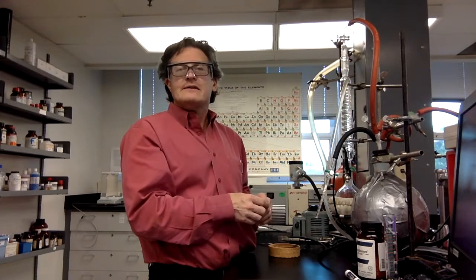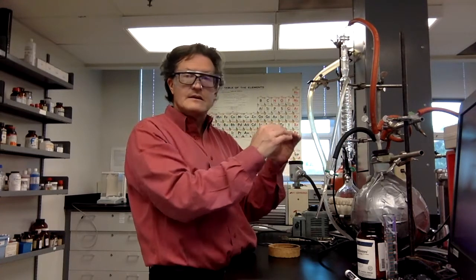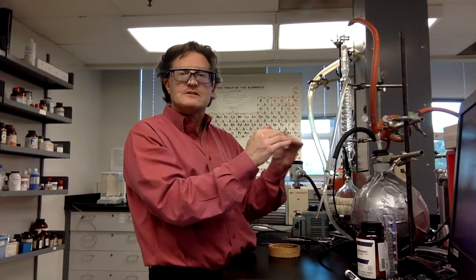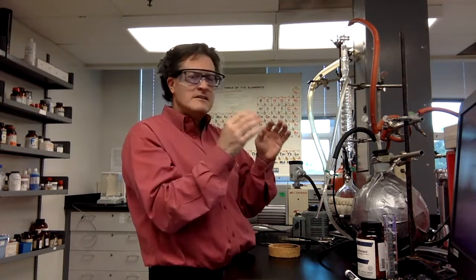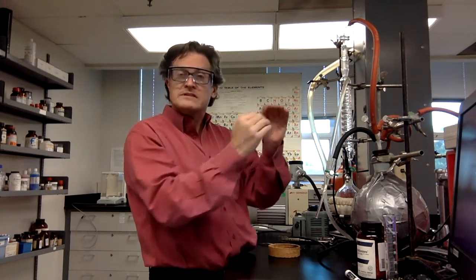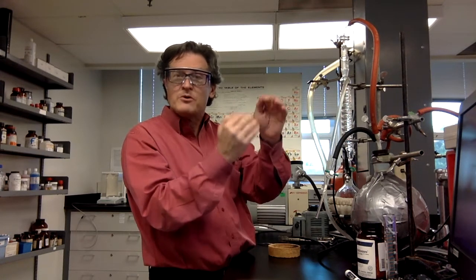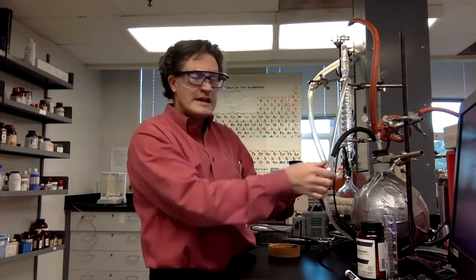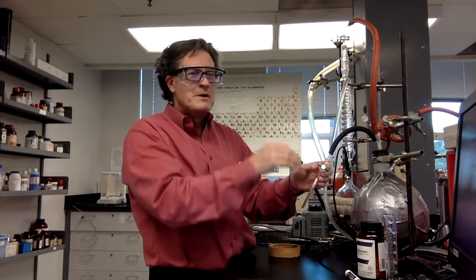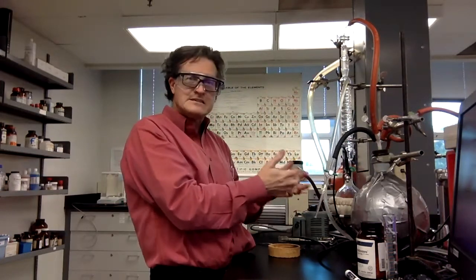What we're going to do is heat up the system and set the pressure around 20 kilopascals, a little bit higher to start off with. Then we're going to let the system equilibrate. We'll know it has equilibrated when the temperature and pressure are stable. Then we'll let in a little bit more gas, pump up the pressure. We want to get the system to boil again.